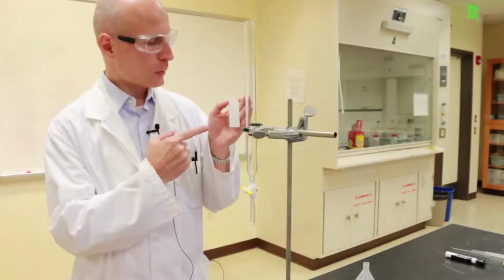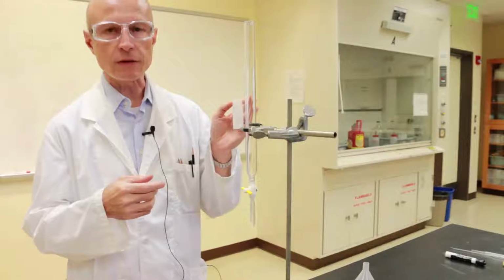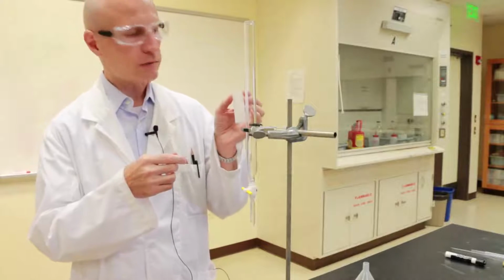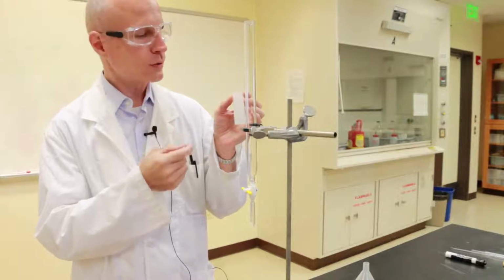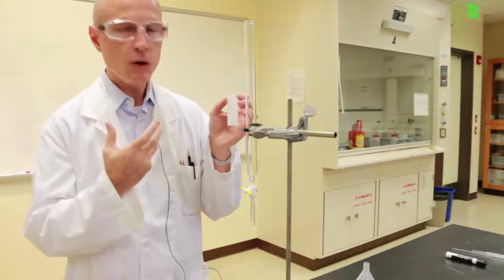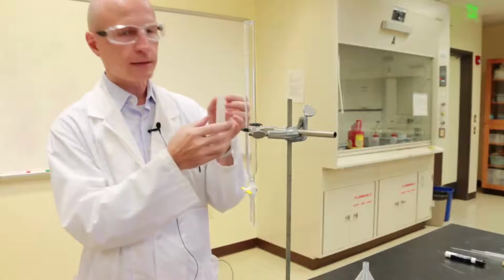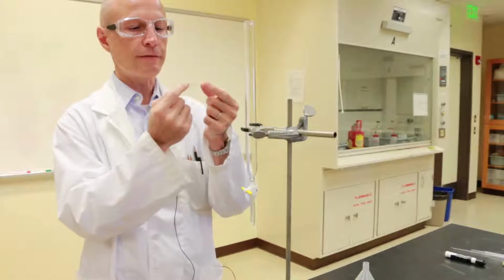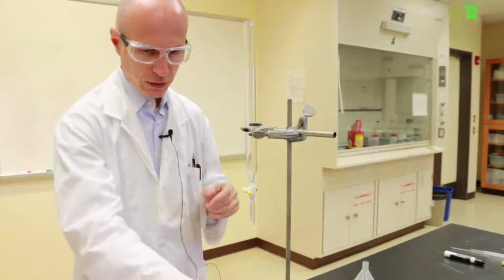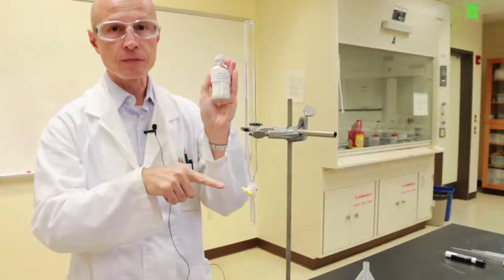You are already familiar with TLC, which is a separation technique that uses silica gel chromatography. TLC is an analytical technique, meaning that all you get out of this technique is information. You're using way too little compound for it to be practically useful. If you want to have a sizable amount of compound, you have to scale it up. So to scale it up, you don't use just a very thin layer of silica on a plastic backing. You use a lot of silica and you pack a column of it.